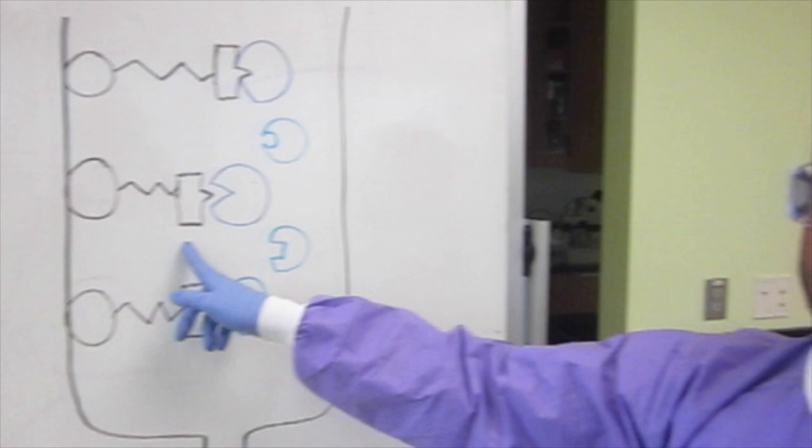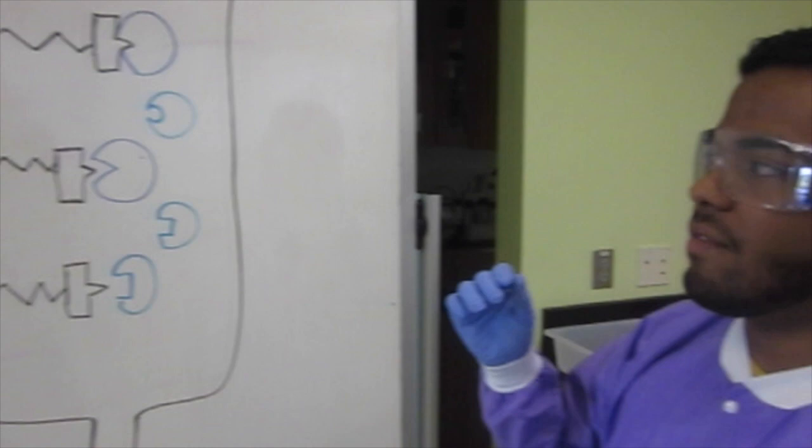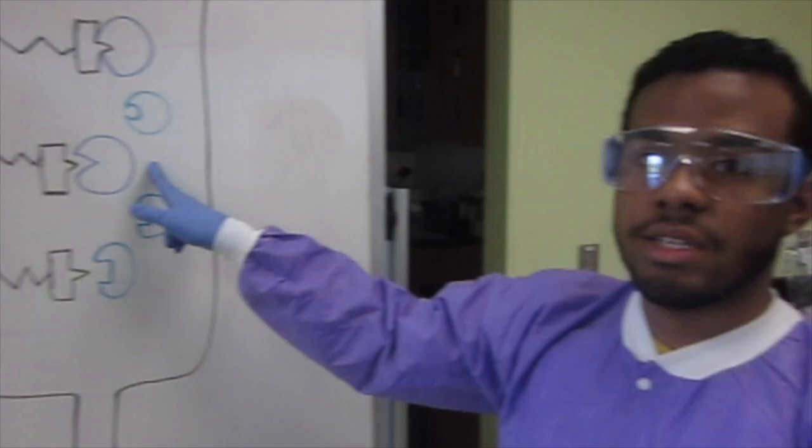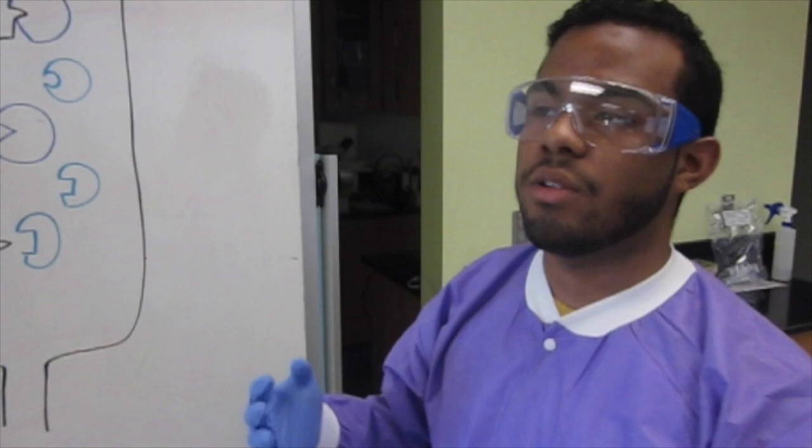We also have to remember that this cell lysate contains many non-competitive and non-binding proteins. We're going to use gravity to maintain a slow enough flow rate so we can capture our GST Campari. Then we'll wash and elute it, and in our elution fractions we should ideally have just GST Campari.